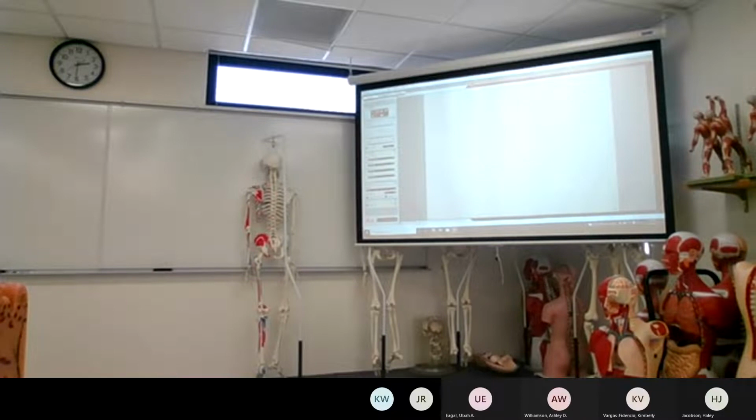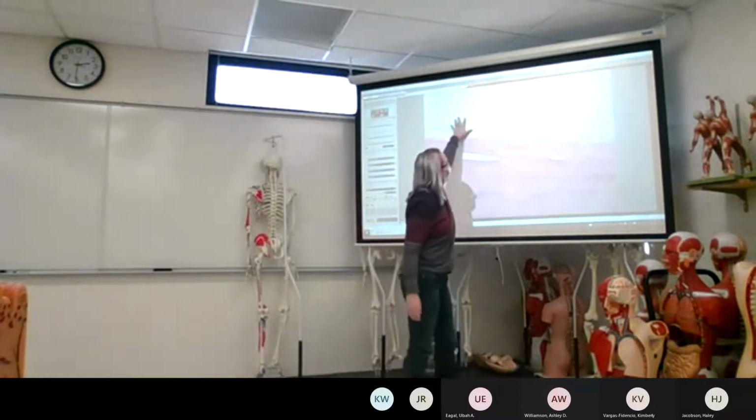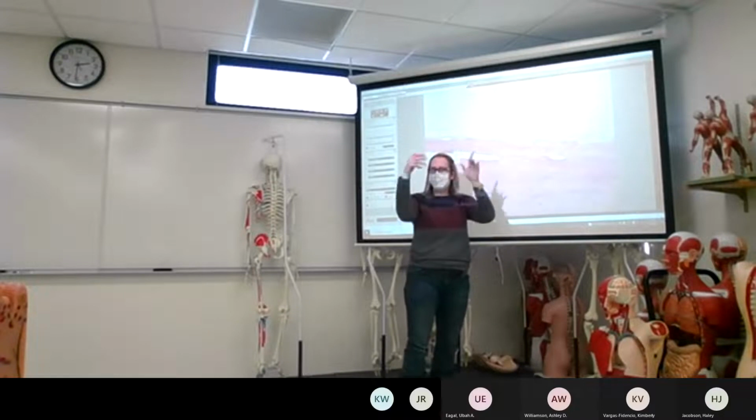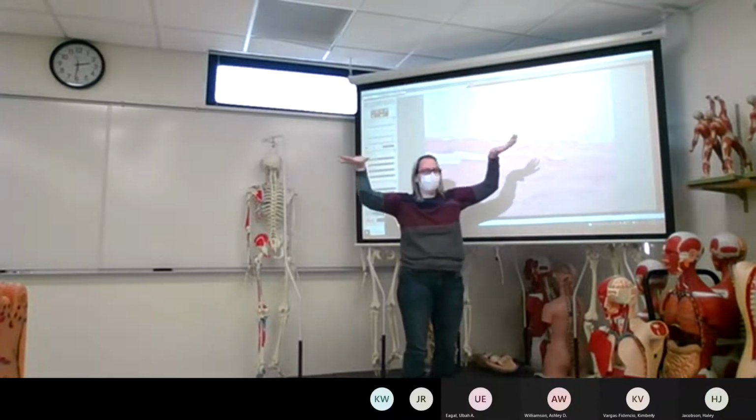Now we're getting into our dense tissues. And look, you can see a little bit of fat. So it's kind of like, here's some fat, and then there's a little bit of a fibrous connective tissue here that's irregular, probably holding the spot for the organ.